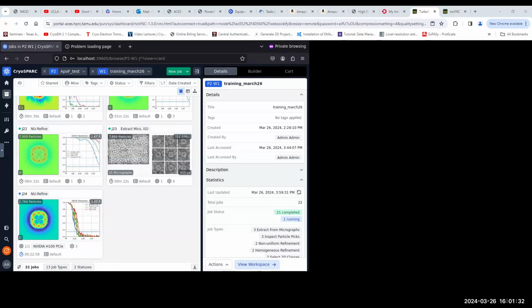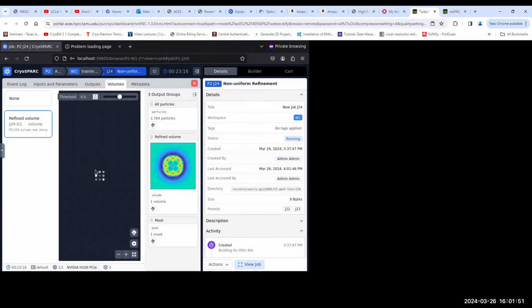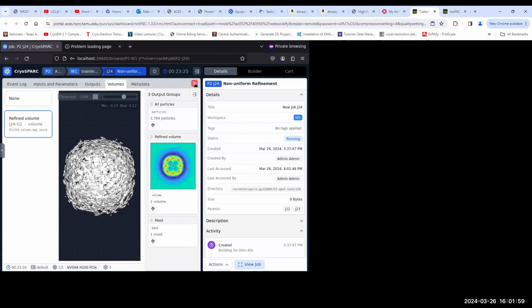Okay. But when we're running a job, we can only use a maximum of 1 node, right? Or will it spread across nodes? No, currently it runs on one node. But you can select 2 GPUs, just not during the short course. I limited it to 1. But in the regular CryoSPARC portal app, you can select 2.